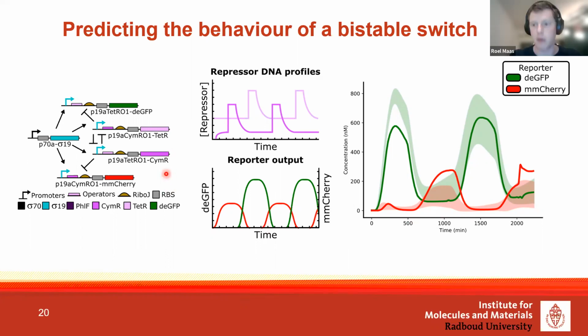We were very much amazed by those results, because this shows that we were able to take one system, estimate parameters using that system, then change the system both topologically and also change the gene structure of those genes we used to estimate the building blocks. And after that, we were able to almost quantitatively predict the behavior of that system.